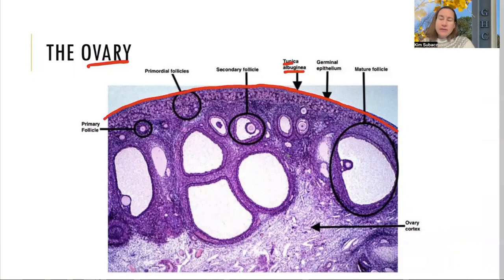And then we have this succession of development of eggs, the little oocytes. The little oocytes are going to be wrapped in follicles, and those things will grow and develop. So all of the eggs are going to be hanging out, born in this area along the edge of the ovary. So I hope you can make out that the edge of the ovary is kind of lighter colored. And the lighter colored section is the primordial follicles. We're going to go into each one of these in just a minute. But I just like to show you the whole ovary and that you can see everything all at once, mostly on just scanning power on your ovary.